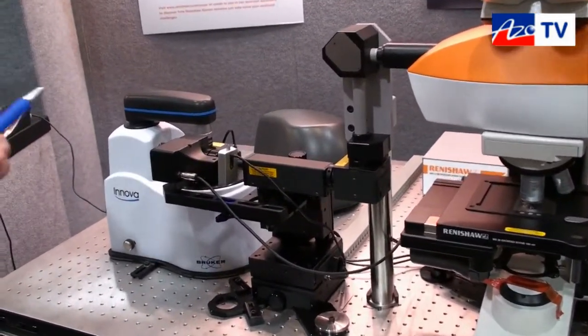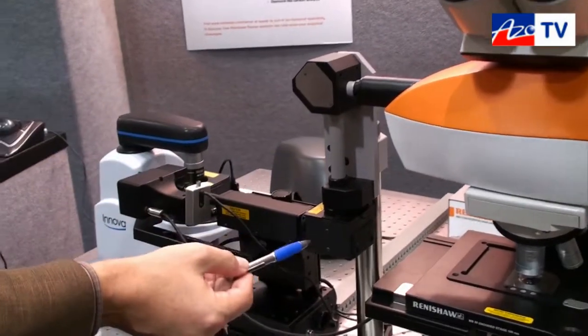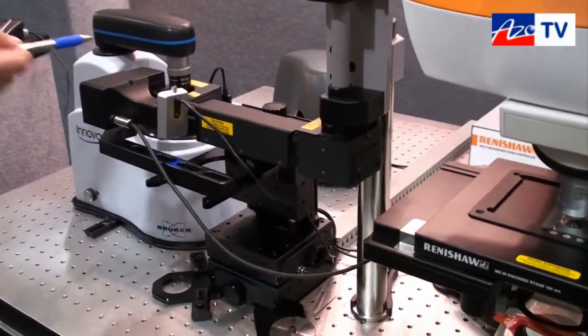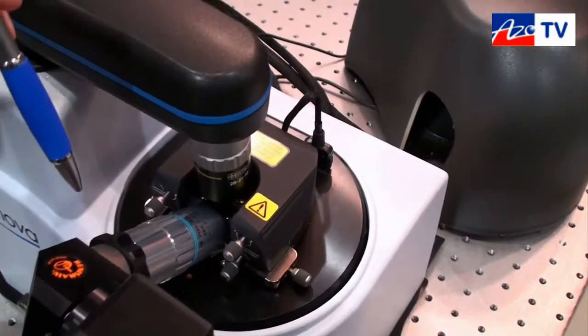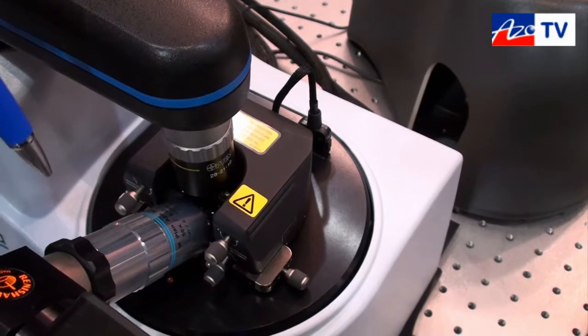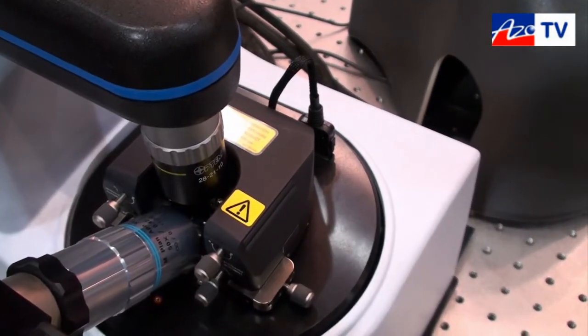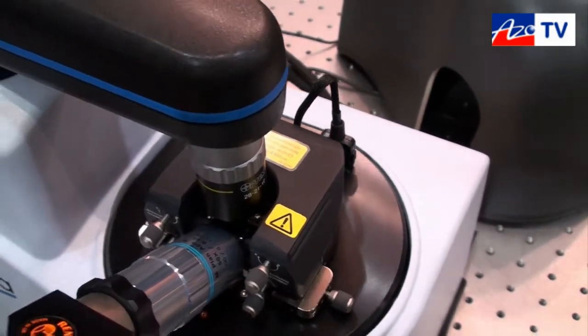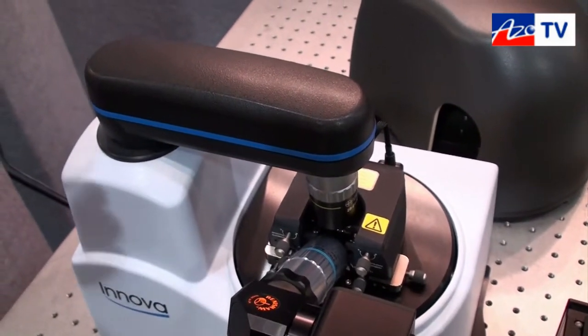What we're doing on the hardware side is we're coupling the laser beam out on the side, guiding it down a series of mirrors into an objective looking at about a 30 degree angle. That objective illuminates our AFM tip and generates an enhanced field so that we can do what's referred to as tip-enhanced Raman spectroscopy.